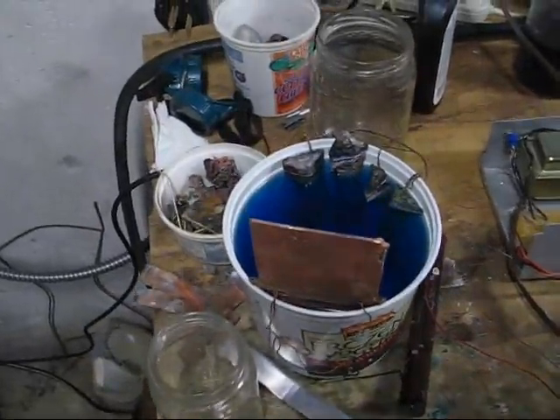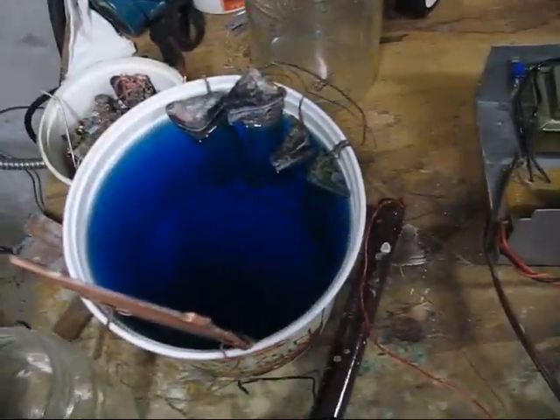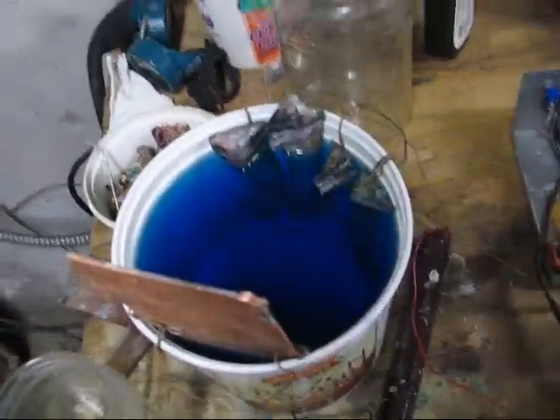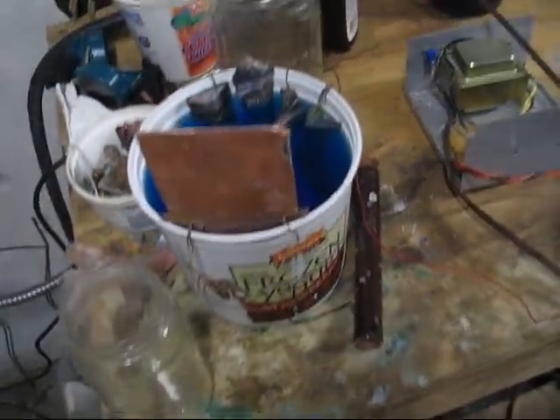I have an interesting chemistry video for you tonight. Here we've got a cell — this is just copper sulfate and acid and stuff. I'm just doing electroplating here; this isn't actually what I'm talking about.